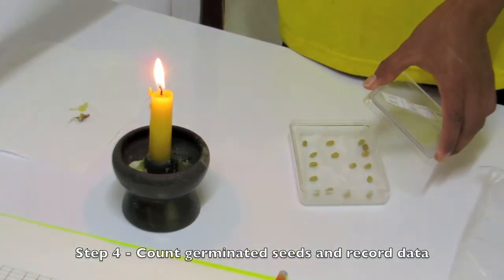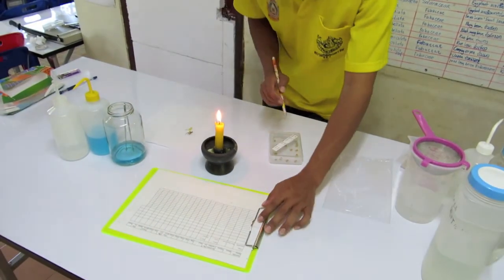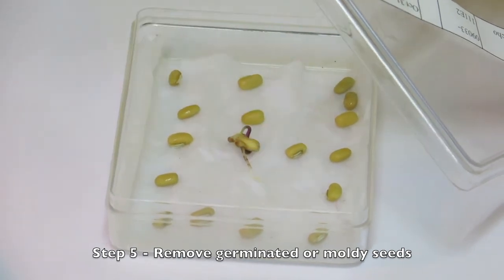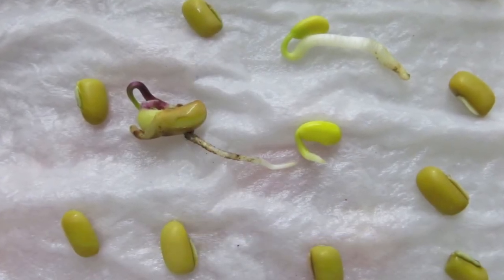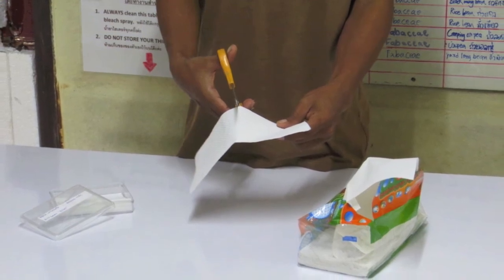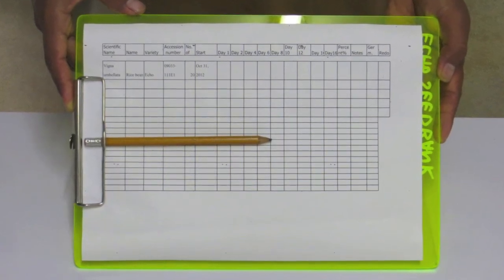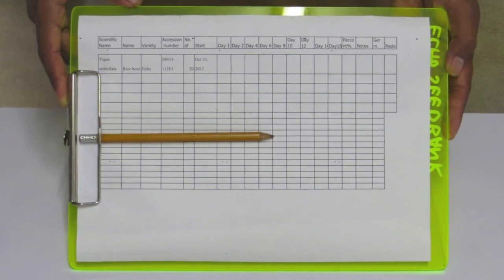Number four — count the number of germinated seeds and note this number on your data collection sheet with the corresponding date. Number five — promptly remove the germinated seeds or any that may be molding to prevent spread to neighboring seeds. Remove moldy seeds regardless of germination. If the mold is particularly bad, replace the contaminated liner with a fresh piece of paper towel. Number six — follow this procedure every other day after you check for a total of 14 days. Some seeds, like tree seeds, may need longer than 14 days to germinate, in which case extend your trial accordingly.